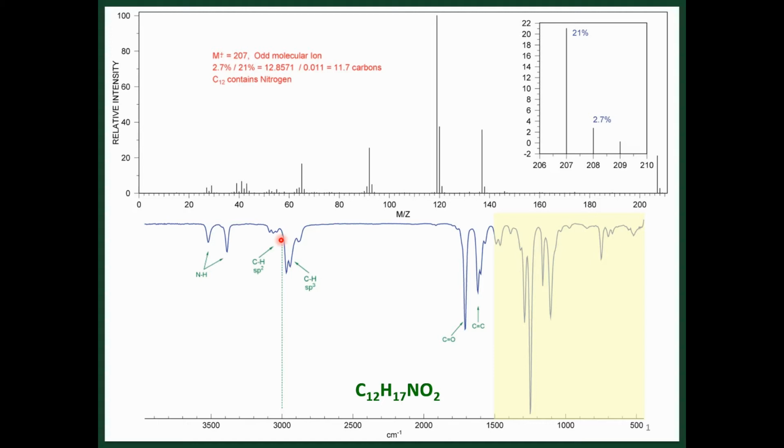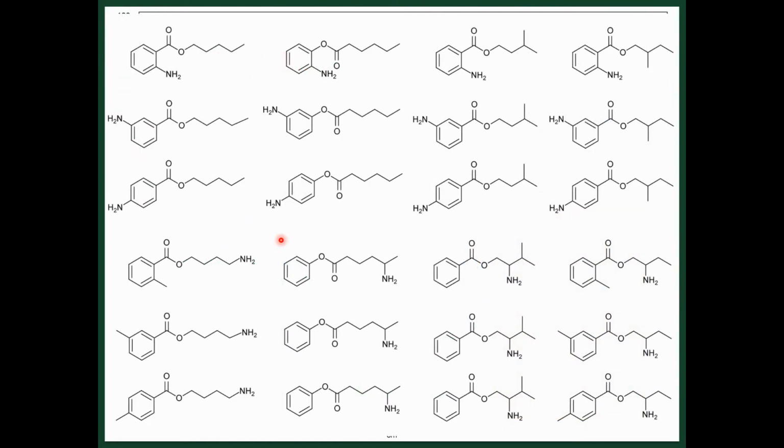and O2. Now, from this particular molecular formula, there's a whole range of possibilities for structures here. Some of these are shown on the slide here. A lot of these involve very simple, minute changes in connectivity, but determining which one of these are just with these two instrumental techniques would be a bit of a challenge. What we're going to introduce to you now is a new form of spectroscopy, which is very powerful and allows us to really unambiguously assign the structure of a molecular sample.